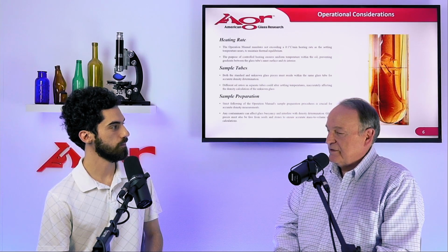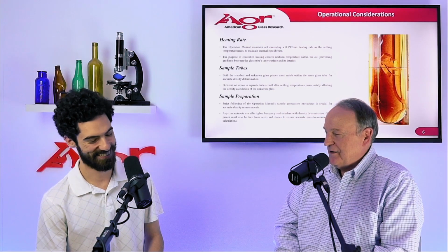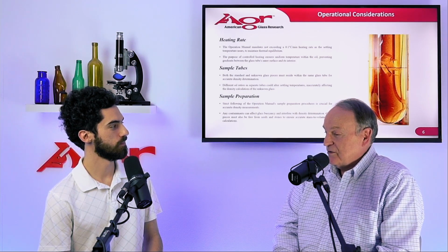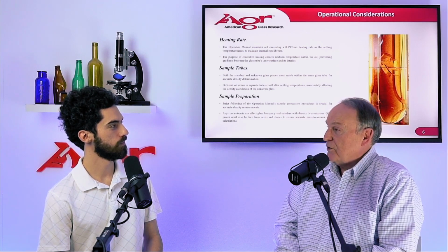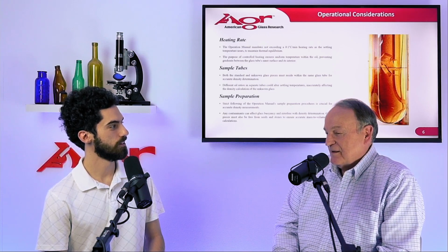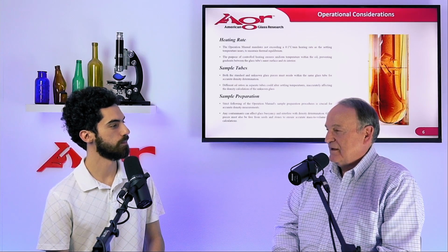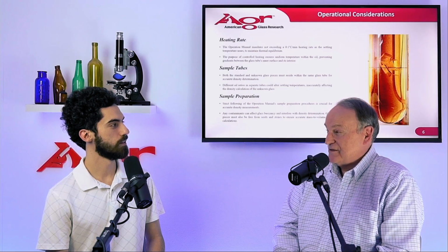Now, most people will only select one piece of glass from the container and make sure it's from a cord-free, seed-free, stone-free area. And then they get a pretty good idea of what's going on with their composition and consistency from day to day. But other times you can utilize this in a different way to be kind of an early warning system of cord. Now, of course, today, a lot of people routinely cut ring sections, and so they're looking for cord in polarizing microscopes. And so you don't need this early warning device as you did maybe decades ago.